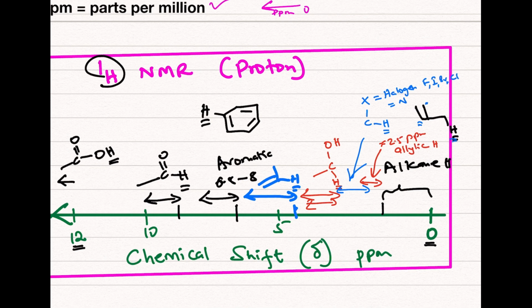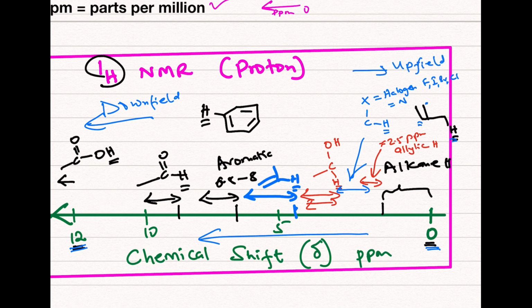So that's proton NMR. It starts from 0 to around 12 ppm. So it increases with the chemical shift value. We call this area downfield. And then on the right is upfield. So in the downfield area, you have less shielded nuclei, so we call those deshielded. While in the upfield area, you have more shielded, so highly shielded.